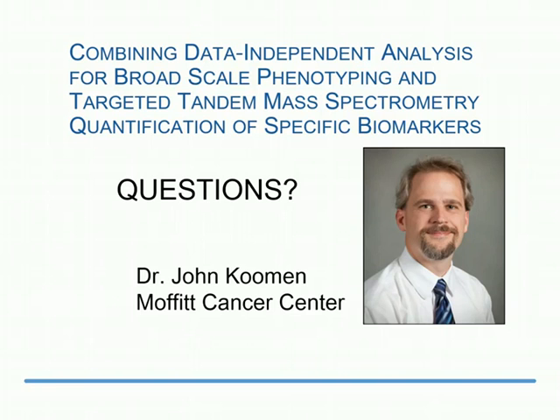Okay, we have time for a few more here. Next question is, is there a maximum acquisition time in a DIA experiment? So I would say no.